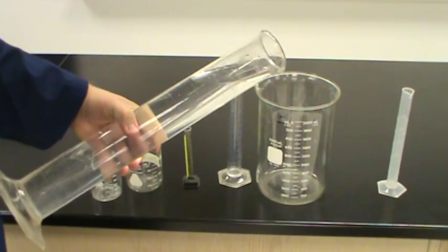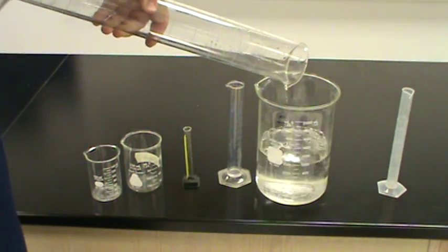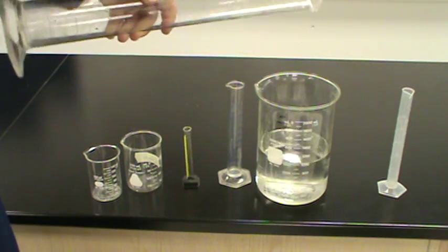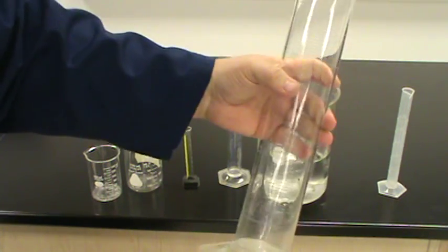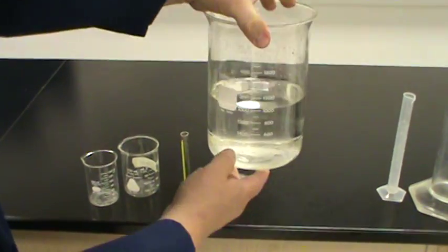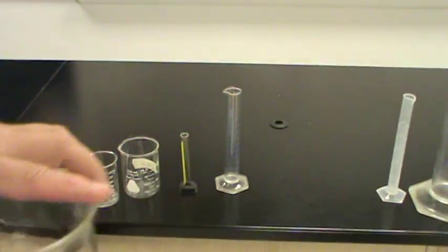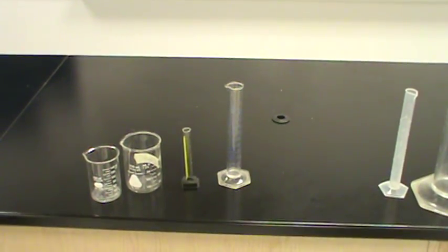So I'm going to pour all of this in. And come on. Sure enough, even though this looks larger, it still only filled this approximately halfway. So our measuring devices do work the way they are supposed to.